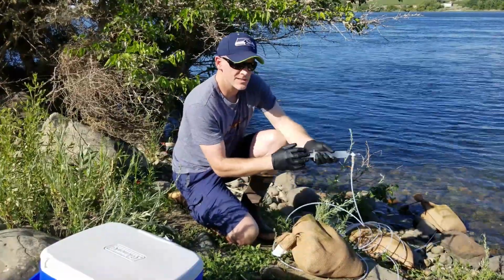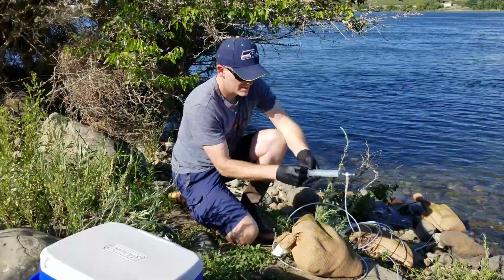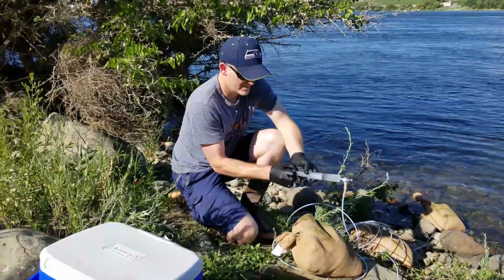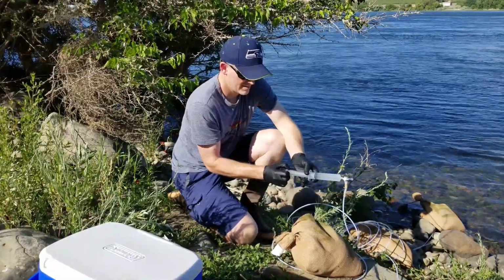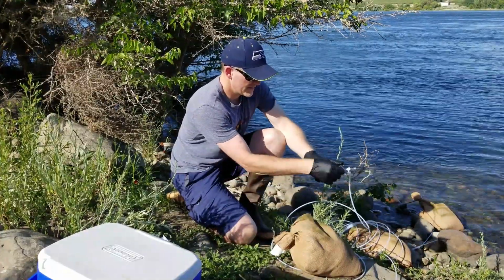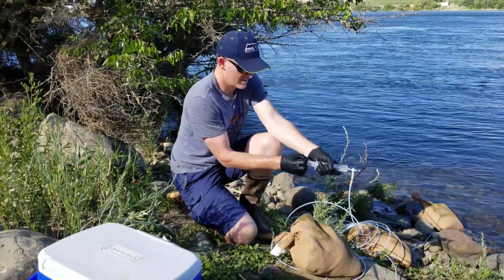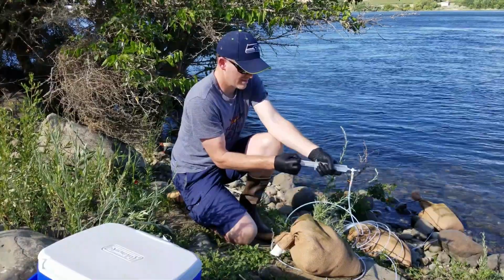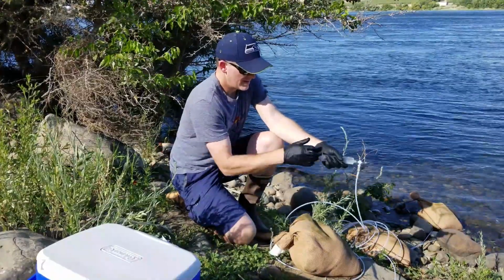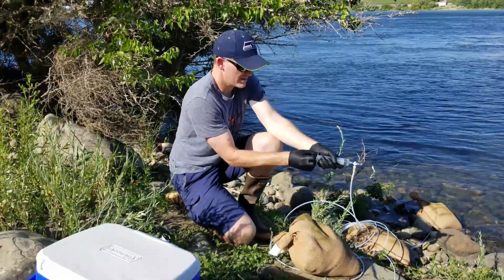And keep going. Now we're going to expel this water. We're going to flush the syringe 3 times before we take a sample. Expel that water. That's the last flush. The next volume we collect is going to be for an actual sample.